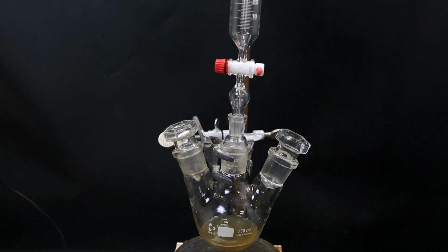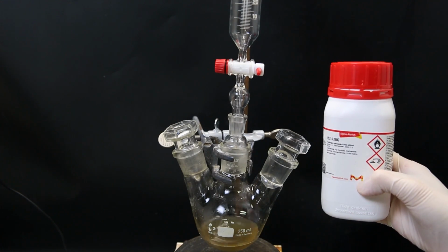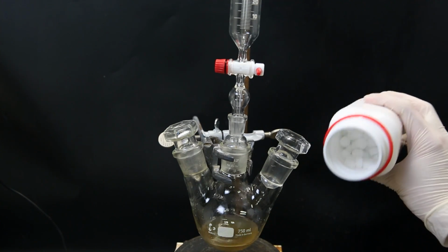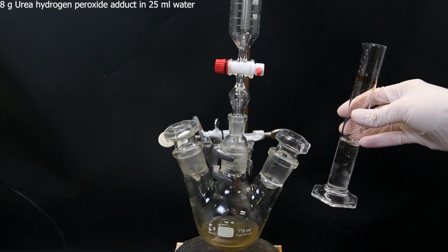Now to produce the final radical product, I will use the urea hydrogen peroxide adduct, which allows for controlled release of hydrogen peroxide and the formation of the radical product. It comes in these little 1 gram tablets, of which I dissolved 8 in 25 ml of water, and I add that to the dropping funnel.